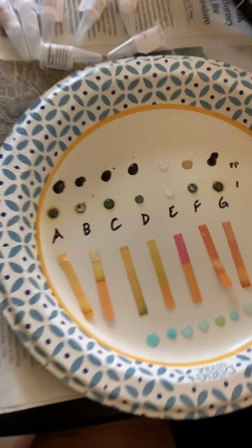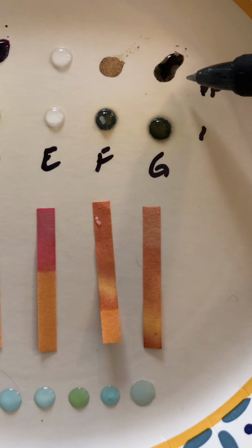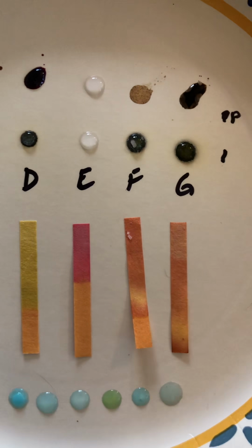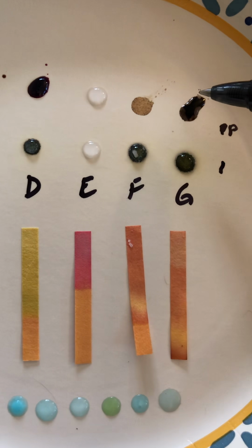So with that, there are two other low pH unknowns, F and G. You can come back and look here. It's kind of hard to see, but I know that these were acidic. And then you can also see here, it's kind of dried out, but G oxidized with the potassium permanganate pretty seriously. F kind of did, it's dried out so it's hard to tell now, but I know that when it was fresh, there was a little bit of reaction, but not much.